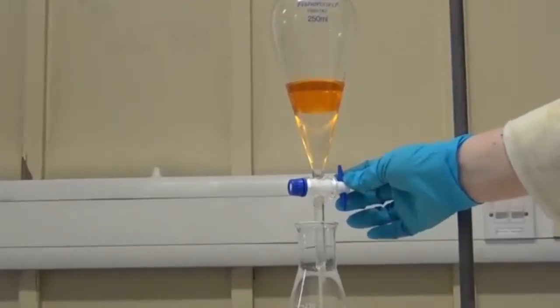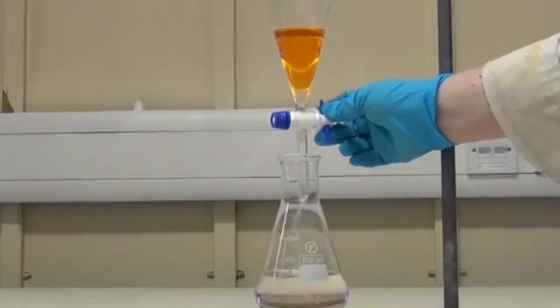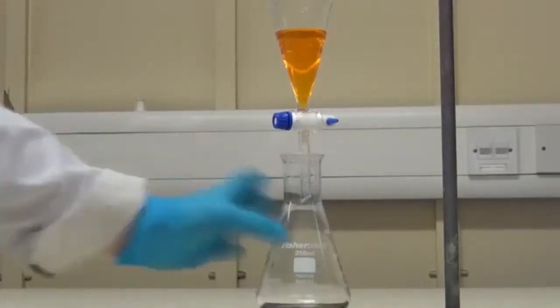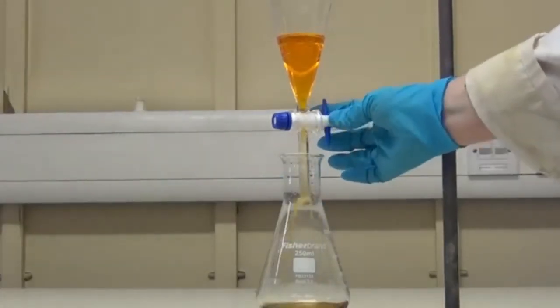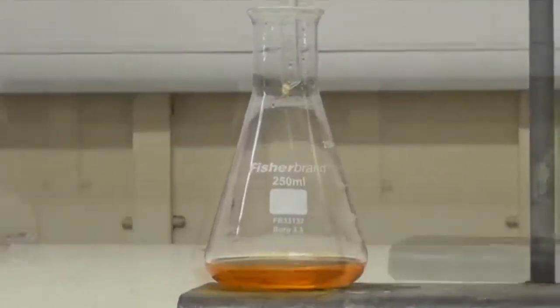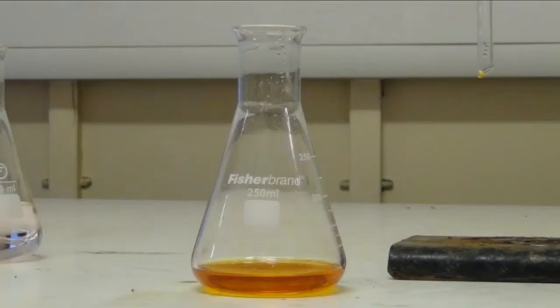And it is better to collect the layer that you want, in this case the organic layer, into a new clean conical flask after each separation. By repeating the extraction process, it ensures maximum separation and therefore helps to maximise the yield of your final product. You then are left with a conical flask of a purified solution that contains your final product.